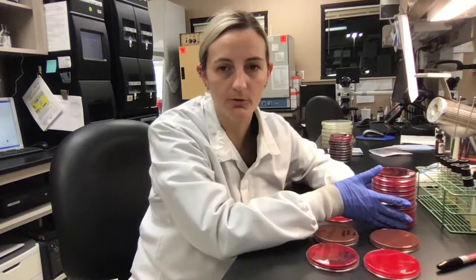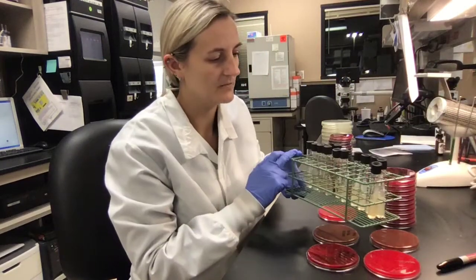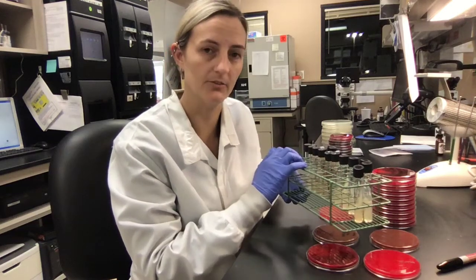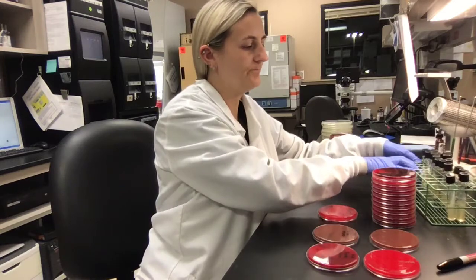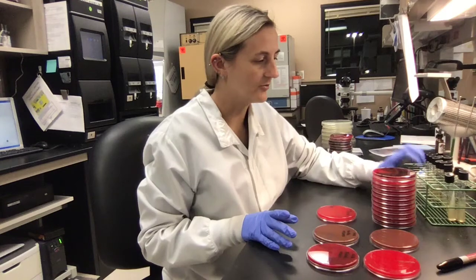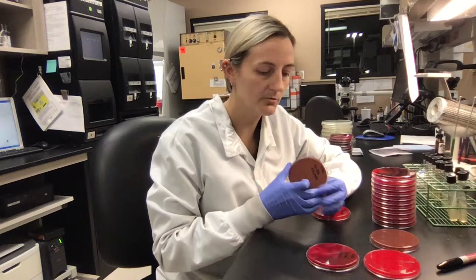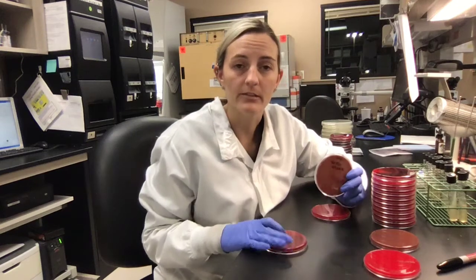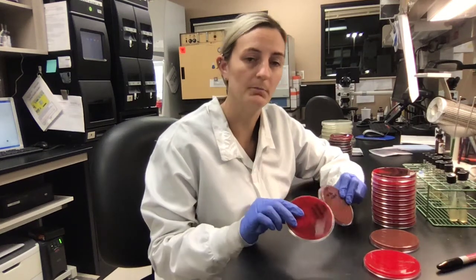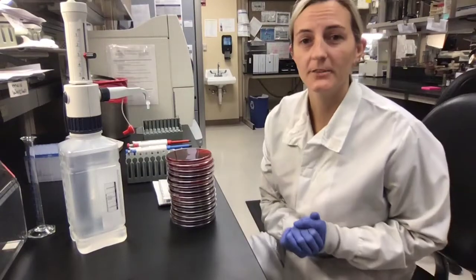There are 13 total organisms. We get them from the fridge — we take them from slants every month and use these slants every week. On day one, which is today, we sub from the slant to the plates. There are two stubborn organisms, Haemophilus influenzae and Strep pneumo, that don't like the slant, so we plate from plate to plate because that's what they prefer.